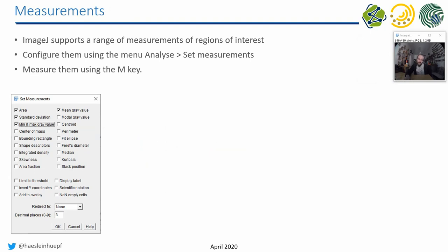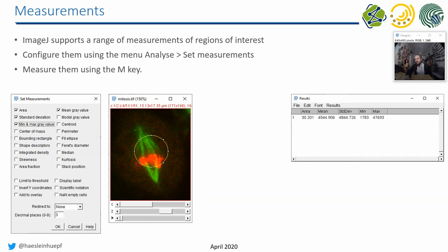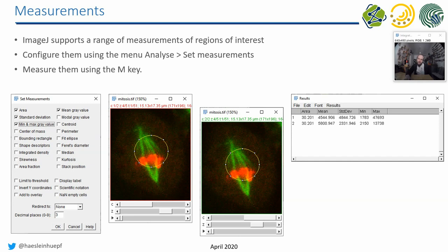ImageJ supports a range of measurements — for example area, mean and standard deviation of gray values, and more. You outline the region you're interested in, set measurements in Analyze > Set Measurements, press the M key, and the configured measurements appear in a results table. You can then open the next image, outline the next region, and do another measurement. Be careful with multi-channel images: you must switch to the correct channel before measuring, as the results table does not tell you which channel was measured.